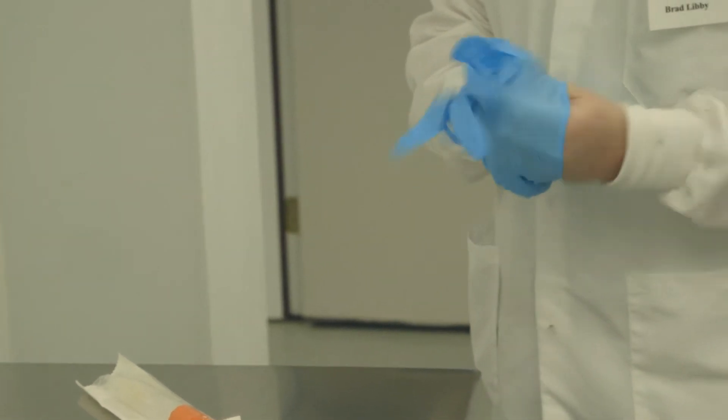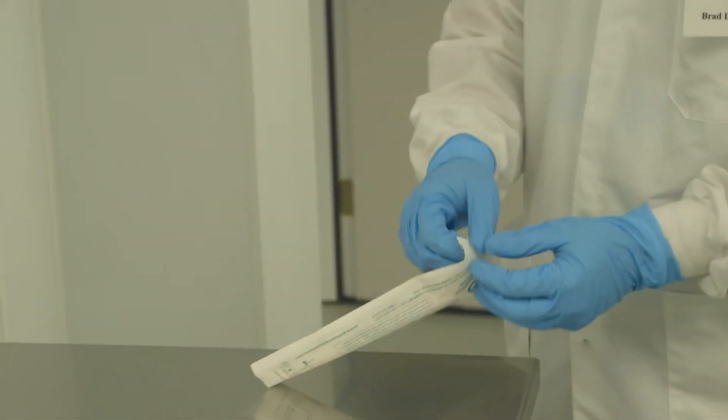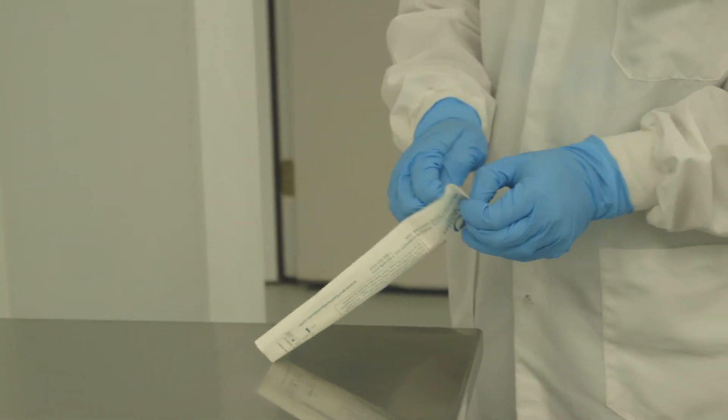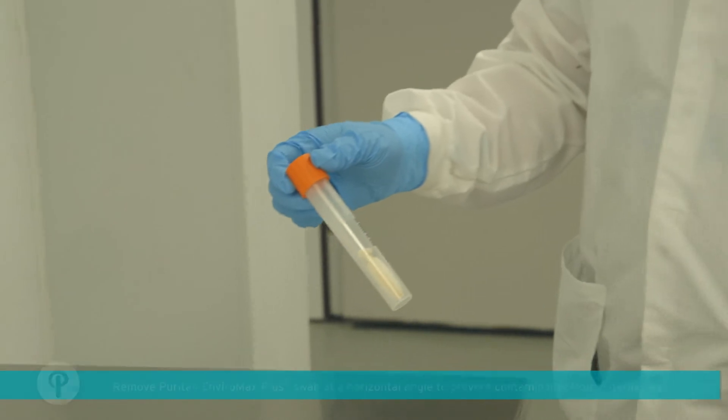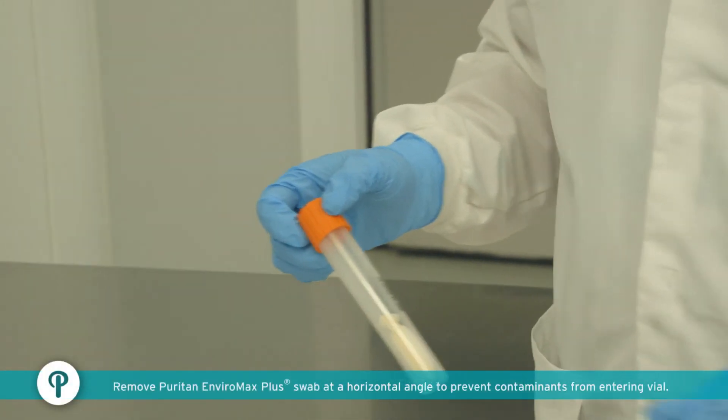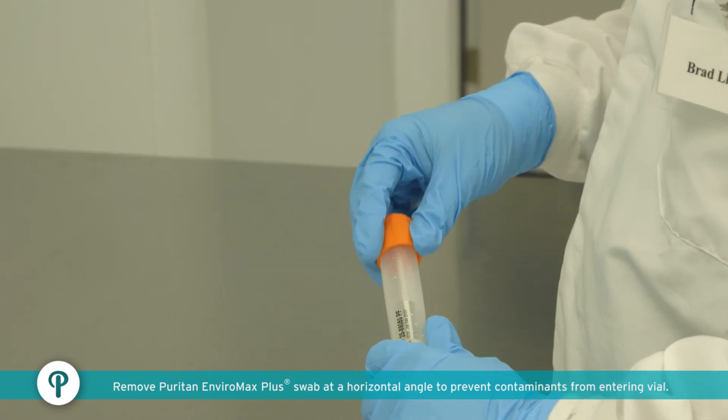Put latex gloves onto hands. Open and remove Puritan EnviroMax Plus Collection Kit from its package and place on a clean surface until ready for use. Remove Puritan EnviroMax Plus swab from vial by holding the cap and twisting counterclockwise.